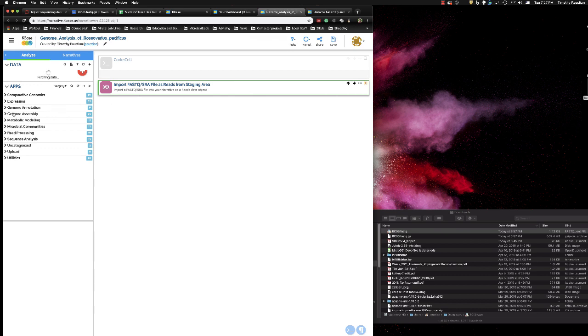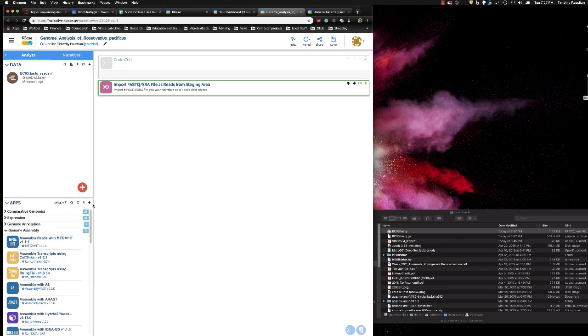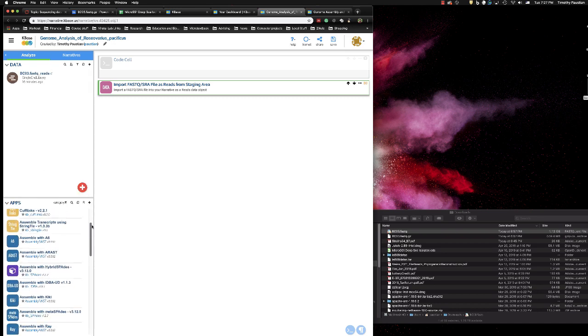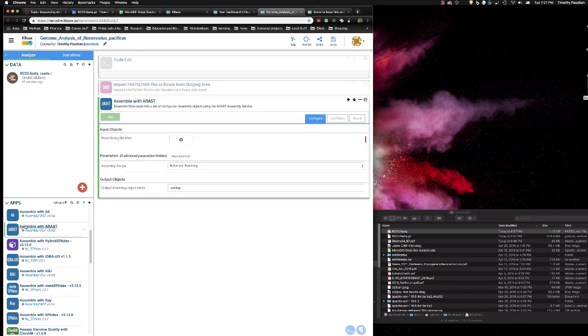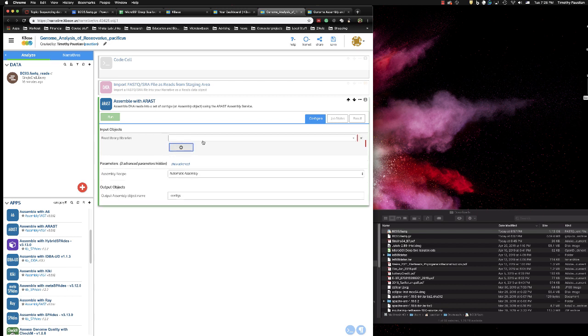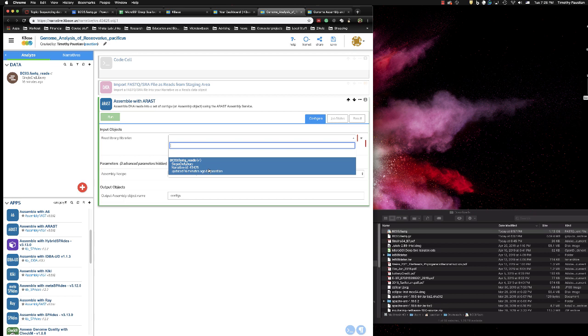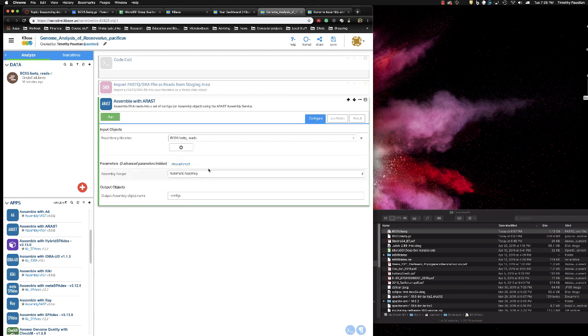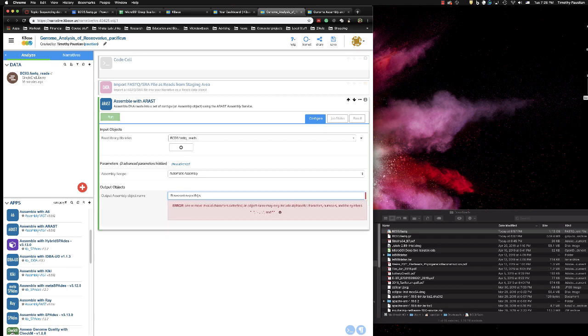The next thing that we're going to do is genome assembly. And we want the ARAST assembler. So you go here, you scroll down, you can see it right here, and you just click on it. And it brings assemble with ARAST in. Now we have to configure it. First of all, it asks you for an input object. Click on the plus and choose the BC03 FASTQ reads. We're going to use automatic assembly. It knows what to do. And output assembly, we're going to call it Roseovarius pacificus.